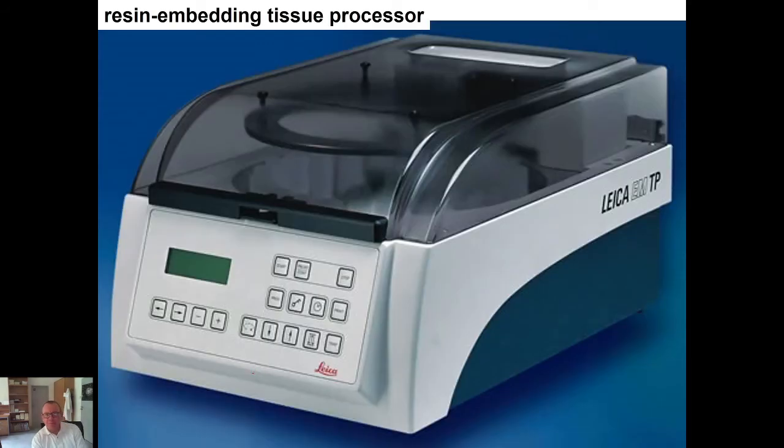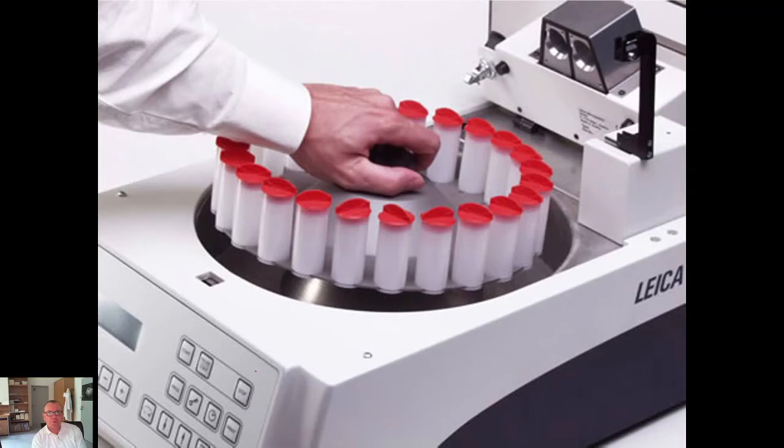Again, some laboratories where a higher amount of resin specimens is prepared can use special tissue processors for many specimens which are processed together.